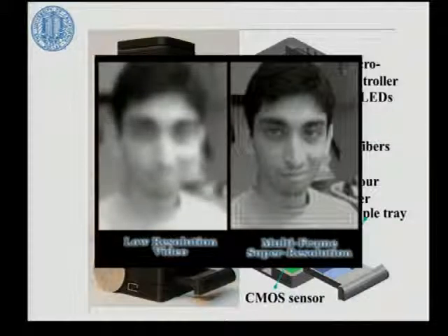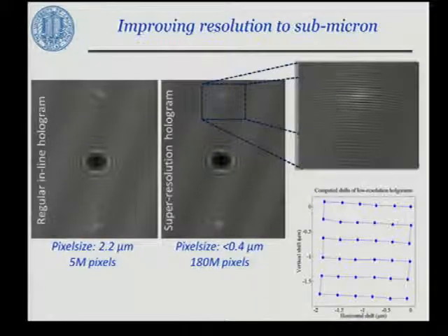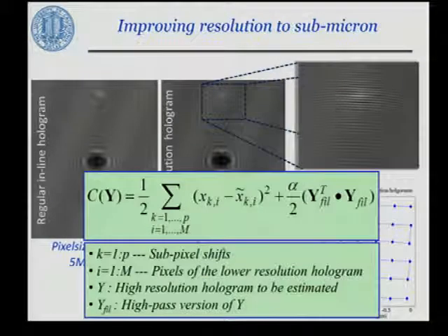So the framework then is, given a set of undersampled holograms, how to retrieve the pixel super resolved hologram so that some of these frames that are washed away in details could be reconstructed back. This is the same thing that we do based on an optimization. Basically, we define a cost function and try to come up with a super resolved hologram which effectively has much smaller pixel size compared to the native pixel size of the sensor that is compatible with all these subpixel shifts.